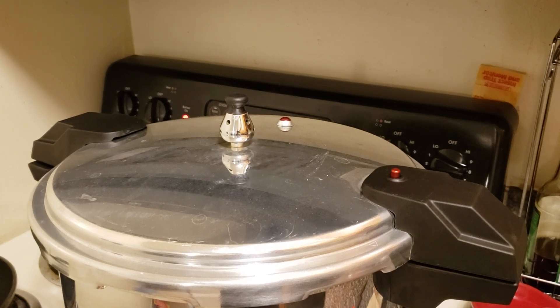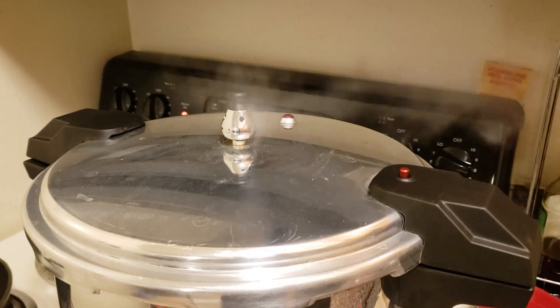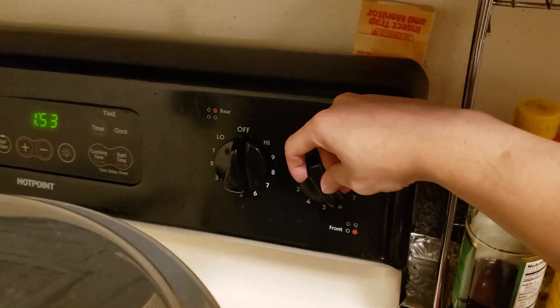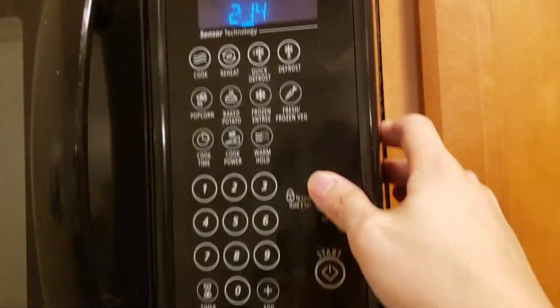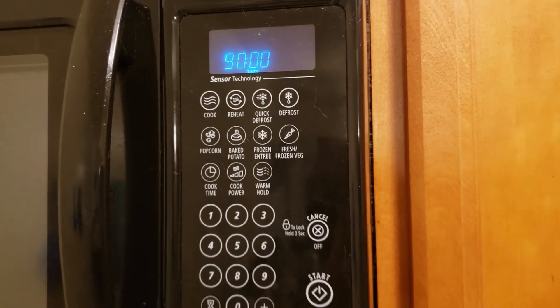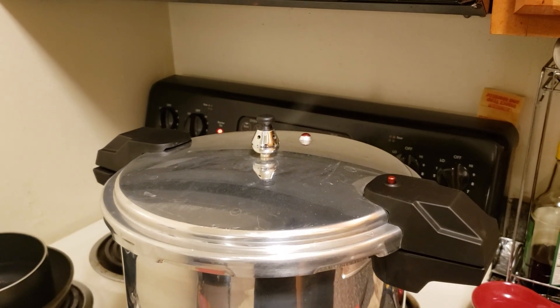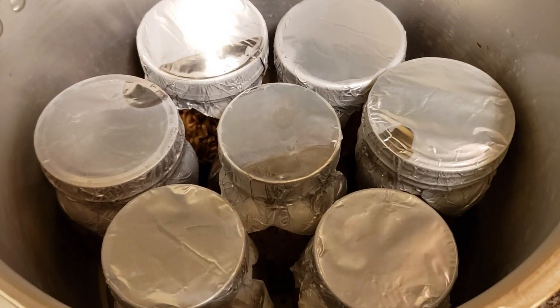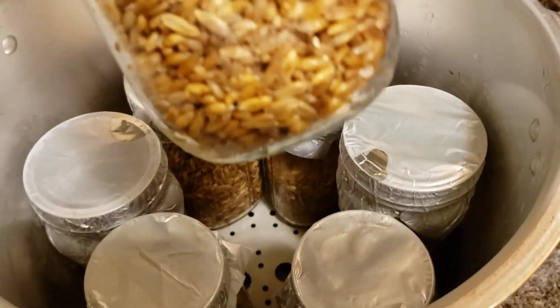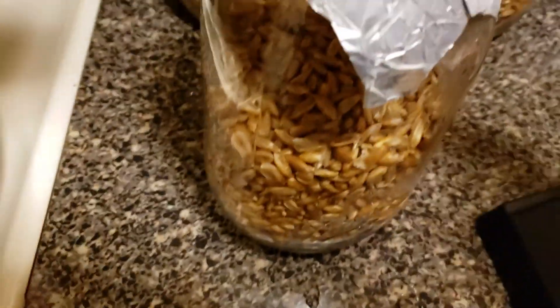Once it reaches the desired pressure, turn the heat down from high to medium-high. This way you'll maintain the pressure inside. If you keep it on high it's going to keep building pressure and the weight will rock like crazy, so make sure you do this step — it's very important. Set a timer for 90 minutes — this is how long we're going to pressure sterilize. After 90 minutes, turn off the heat and let it cool down overnight. Don't mess with the weight; just leave it on — the pressure cooker will depressurize itself.